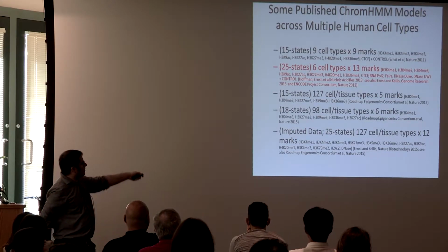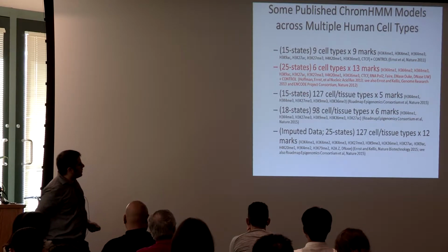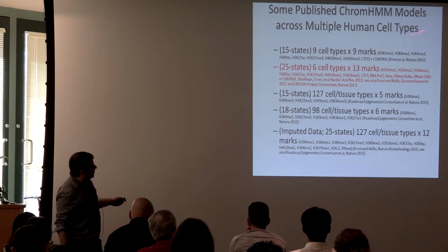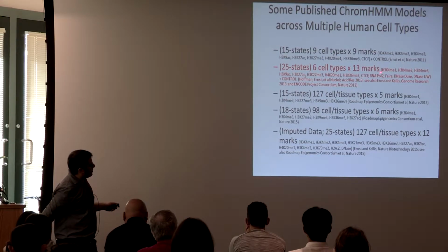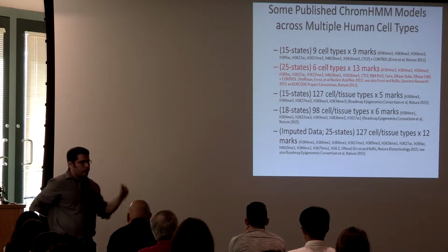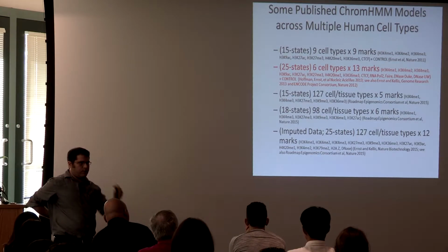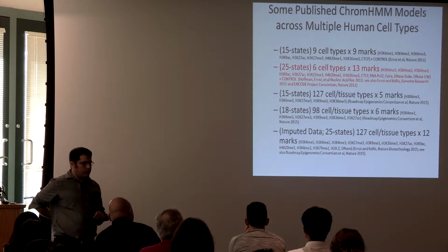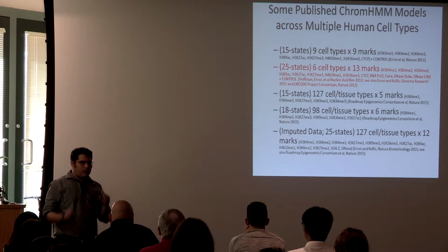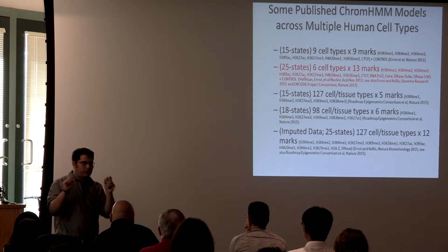The next model, so this work was done specifically in the context of the ENCODE production group at Brad Bernstein's lab. We also did an integrative model, which in this case leveraged the same set of histone modifications and CTCF, but we also combined it with RNA Pol II, so this is the RNA polymerase ChIP-seq. And then, as I was talking about before in response to a question in the earlier session, DNase assays. So these are assays which measure the open chromatin.